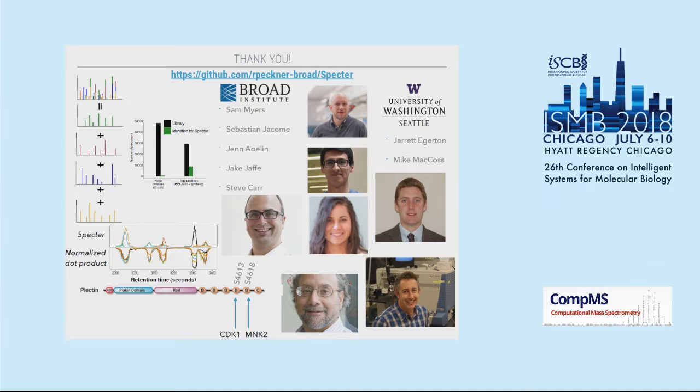So this is great. I think it's really interesting. One question is, in any kind of regression model like this, all the stuff that's not in your library, which corresponds both to noise but also to peptides that you didn't happen to have a library for, or all the unknown peptidoforms, gets lumped into that E term. Which can be problematic, especially if you don't have very good coverage in your library. I wonder whether you've done any kind of downsampling of the libraries to investigate this. So if you toss out some of the stuff from the library, do the detections of the things left in there suffer because the E term has to account for all those unmatched signals?